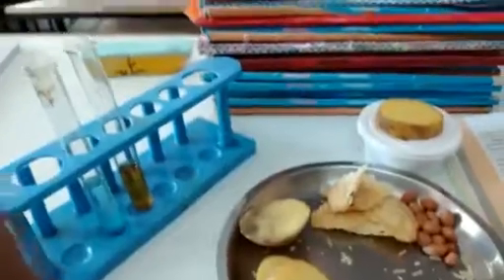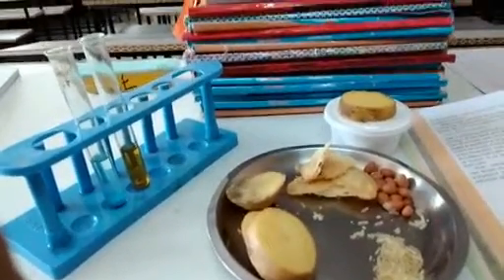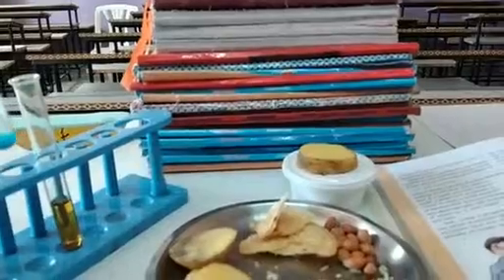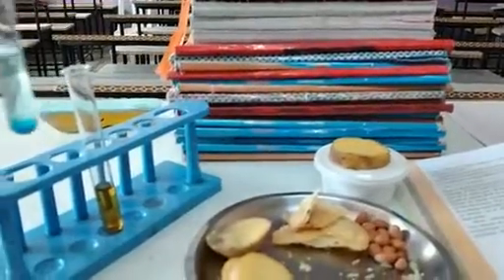So let's begin with the ingredients or the materials which I have collected to show you the three different tests. Here you can see the things which I have kept ready for the test. Two test tubes you can see. One test tube contains copper sulfate solution. I have taken copper sulfate granules in water, and this is for the protein test.